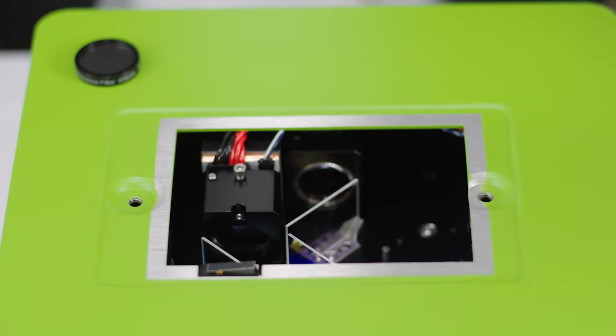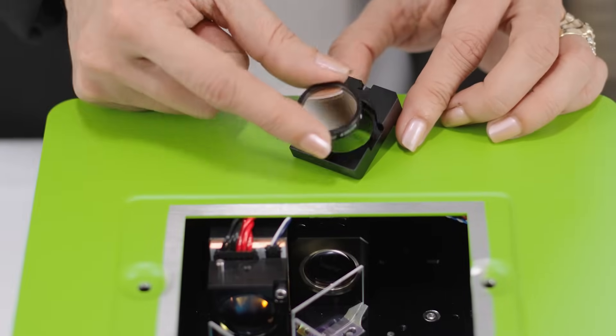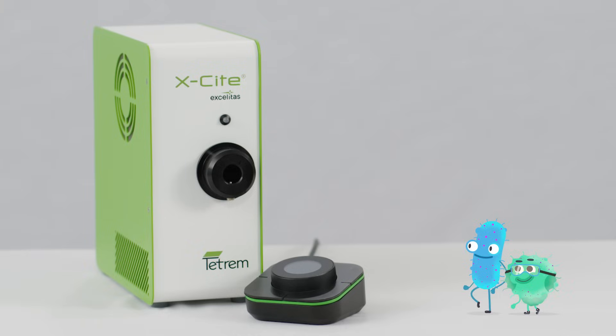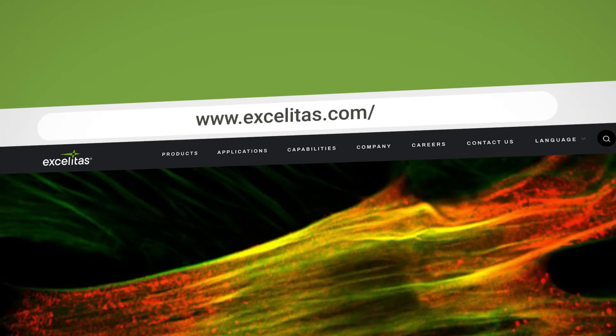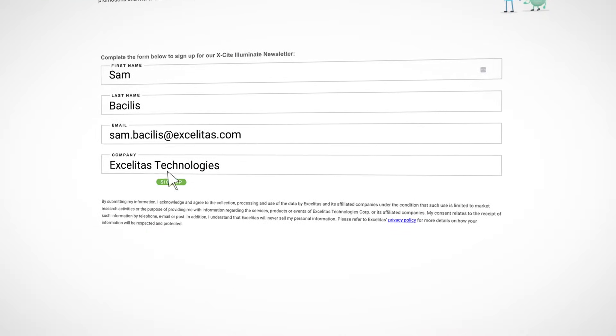To add a filter, simply open up the side panel, unscrew the filter holder, and pop in the filter of your choice. We are very excited about this new product and look forward to working with you. For additional information, please visit our website at Excelitas.com. While you're there, be sure to sign up for our newsletter to receive the latest news from your Excite team.